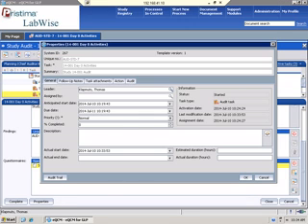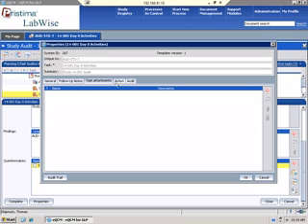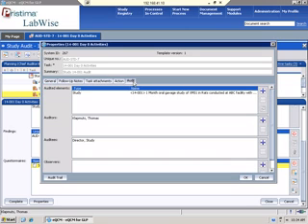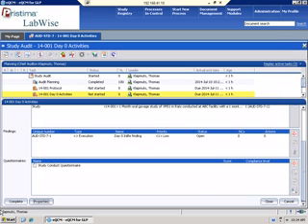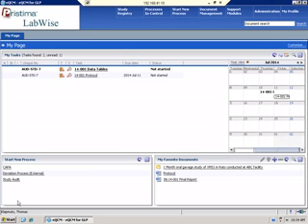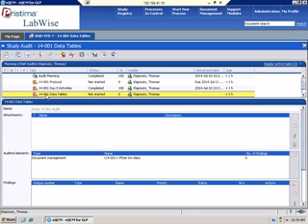Again, I can look at my properties. If there's anything I wanted to put follow-up notes, attach anything. Here's the audit that's part of this task. So again, it goes back to the audited elements, the auditor, the study director, observer. So all of the information that's associated to the task is here. And when I complete it, it comes off my schedule because now the day zero audit is finished. If I come back into the data tables, I can see here the day zero activities is completed, and then I'm still waiting for the protocol and the data table audit to be completed.